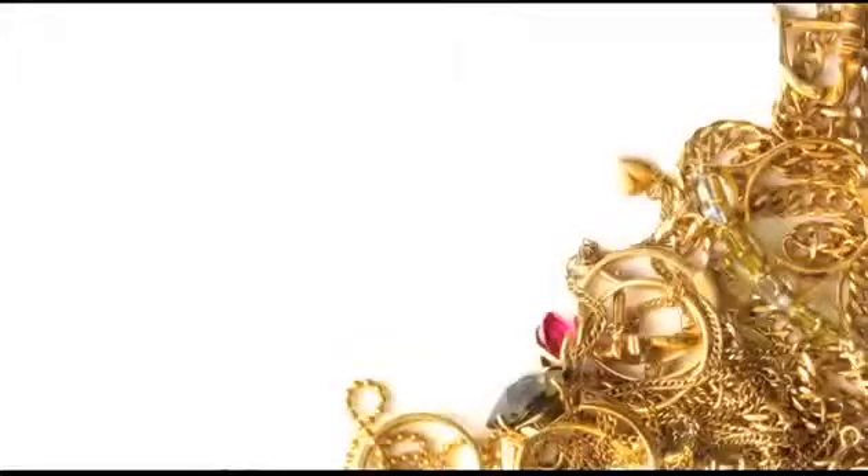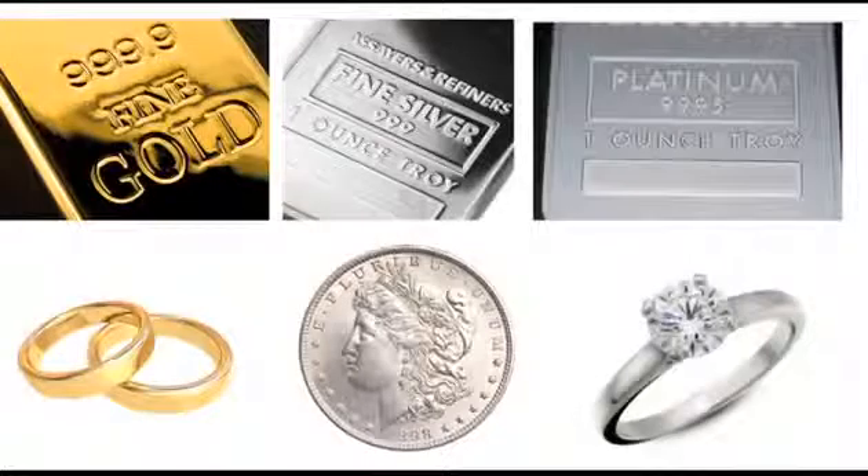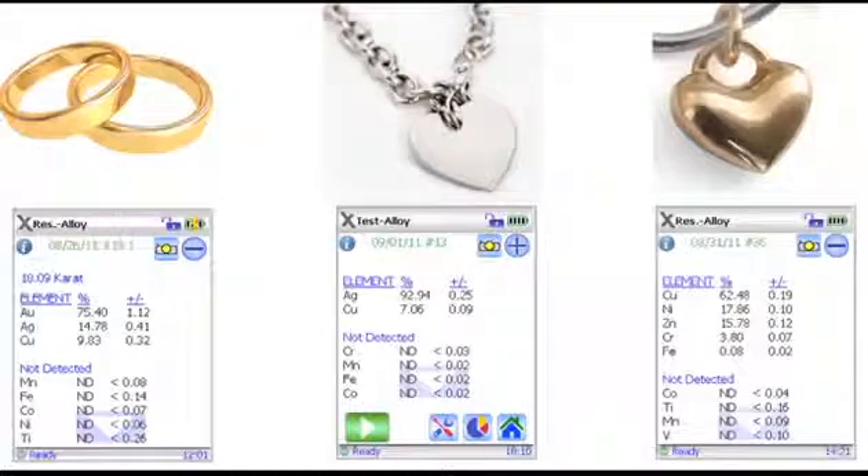If you need to know the composition of jewelry and precious metals, you need the Gold Expert from Olympus Inovex. Gold, silver, platinum and their alloys — the Gold Expert can measure them all. It quickly and accurately determines the caretage of gold items, the purity of silver items, and any other metals that are in the piece.